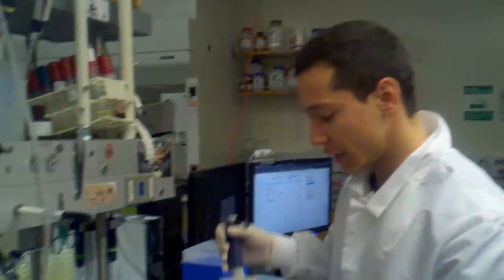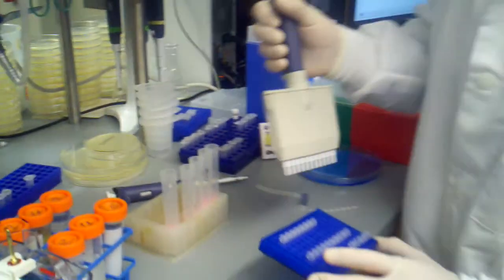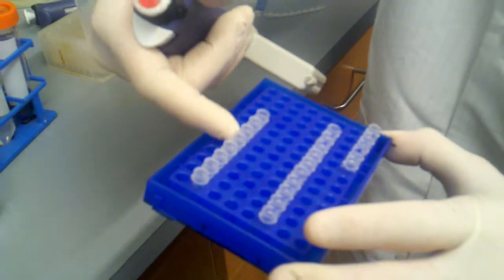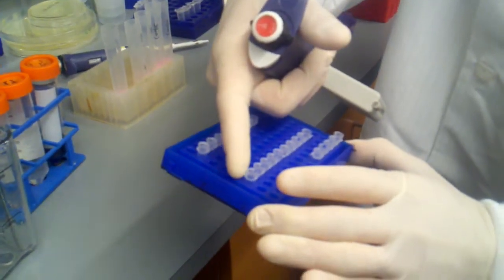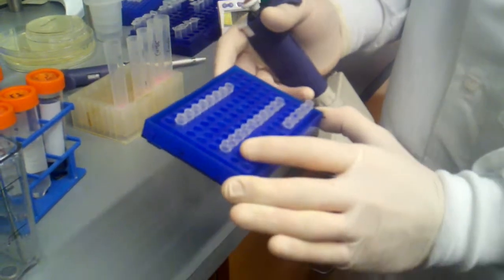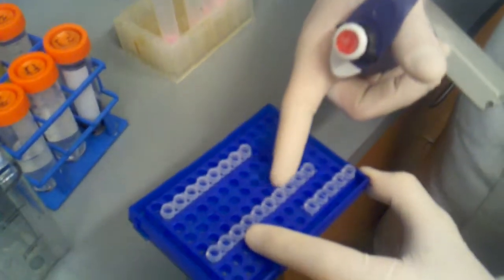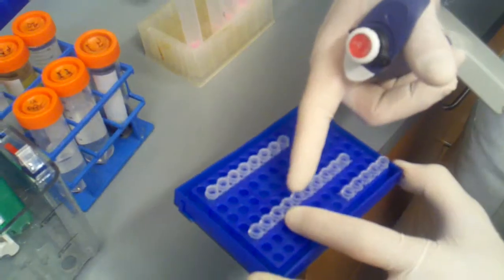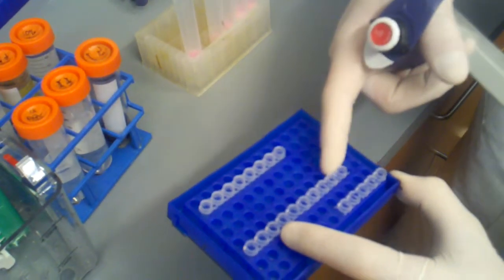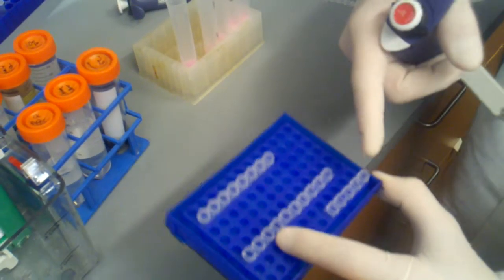So what I've done is I've taken our protein liquid that was in our 24-well block, and I've transferred 20 microliters into these 5 tubes. 1, 2, 3, 4, 5. And then I've set up a bunch of loading buffer in here. So I'm not doing this perfectly exact. I'm just kind of eyeballing it. So I added about 5 microliters of water to all these tubes, 7 microliters of 2x loading buffer, and I'm going to be adding 1 microliter of protein, 2 microliters of protein, and then I'm going to be doing a couple of custom runs here.